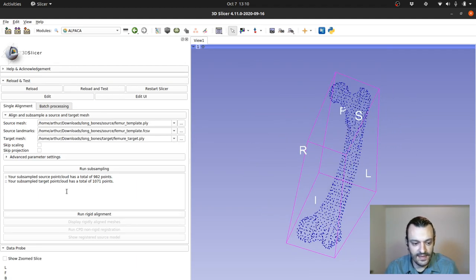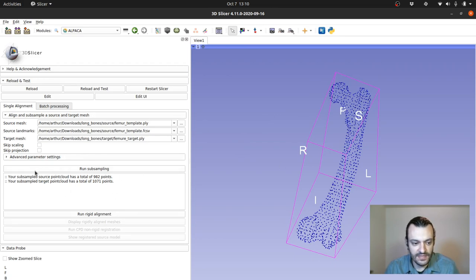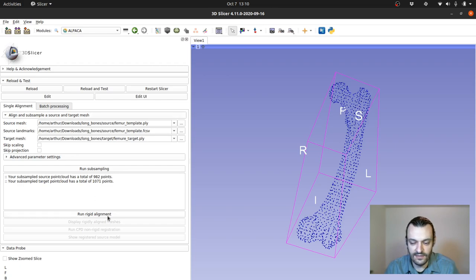And the next step, once you've subsampled your meshes, in this case the source point cloud was subsampled to a mesh size of 982 points, while the target one 1071.